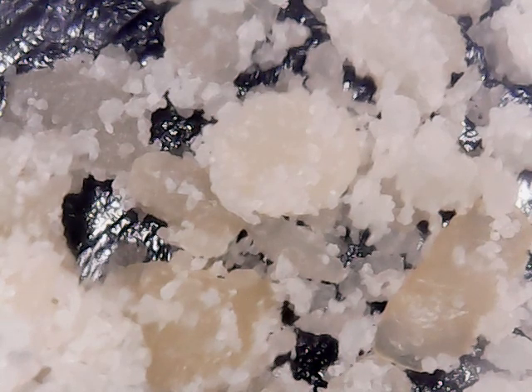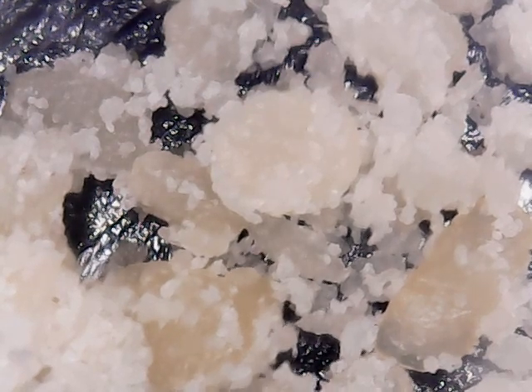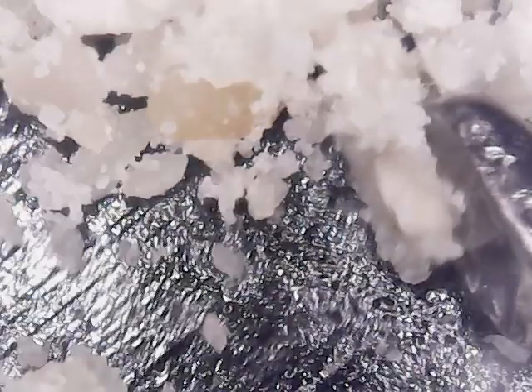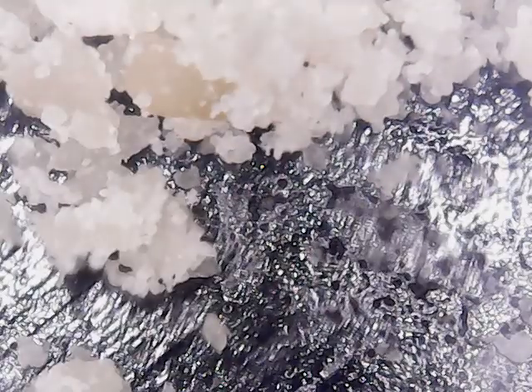I could edit out that noise — I'm going to edit out part of it — but I want to include part of it just to make sure people are aware. That's what Parmesan cheese looks like. That's interesting because you'd expect it to be just chunks that are separate, not big chunks with small chunks on top attached to them. Wow, that's interesting.